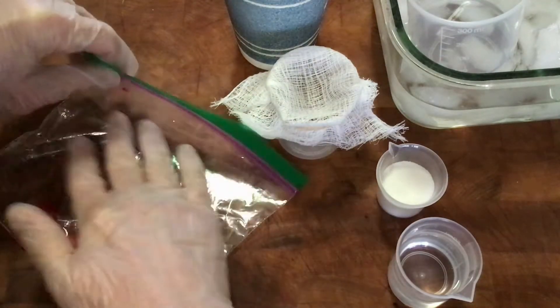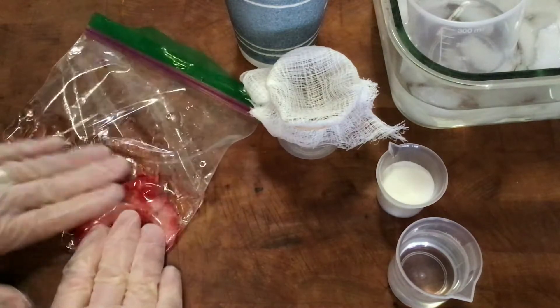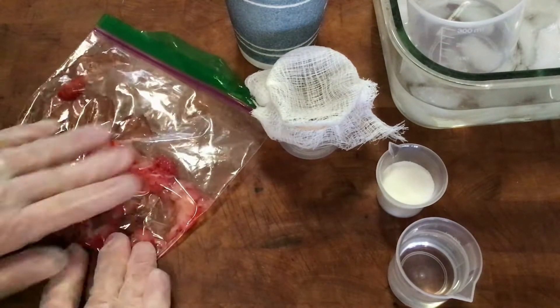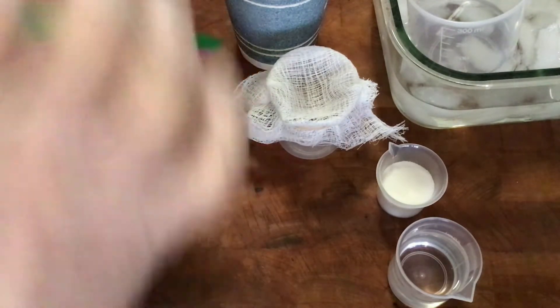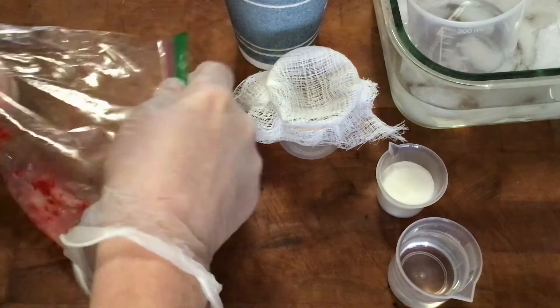I've got the air out of the bag to make the mushing process easier, and I'm just going to mush this up. My finger is really good to get all the bits so it's not chunky — getting all the strawberry broken down.